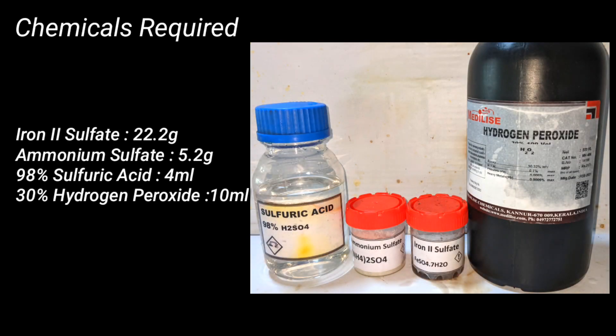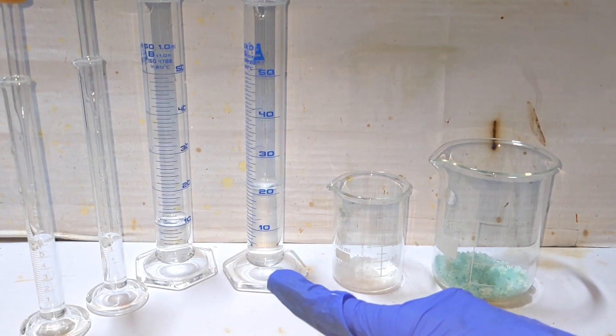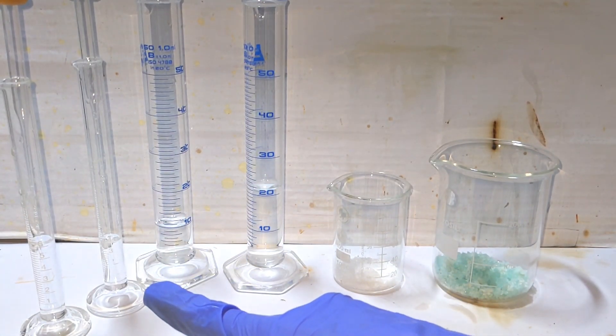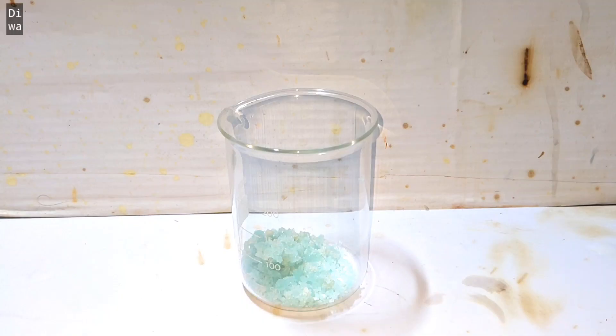Chemicals that you need for this preparation are 22.2 grams of iron(II) sulfate, 5.2 grams of ammonium sulfate, 4 milliliters of 98% sulfuric acid, and 10 milliliters of 30% hydrogen peroxide. Here I have taken all of them pre-measured — the iron(II) sulfate, ammonium sulfate, water, hydrogen peroxide, and sulfuric acid.